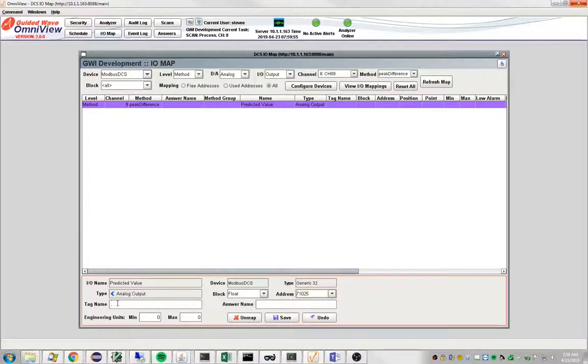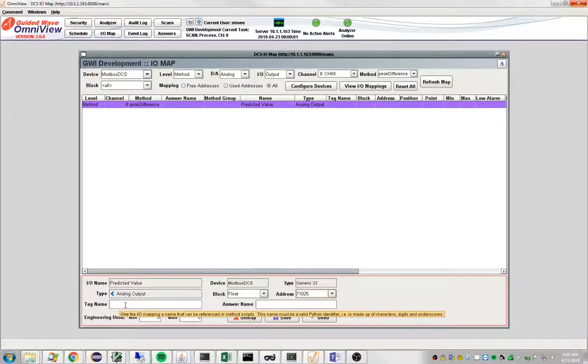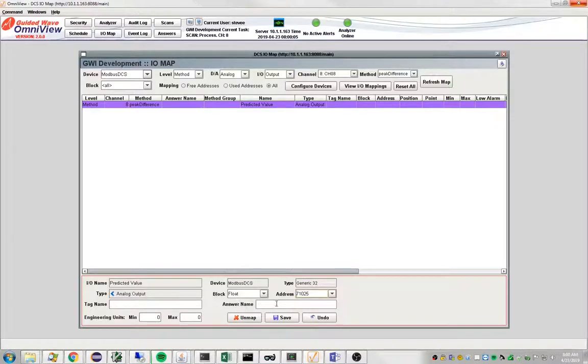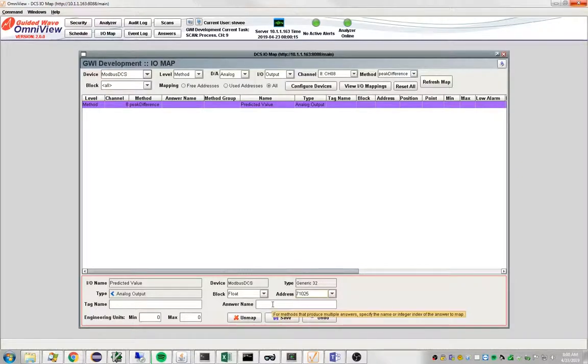Now, there's a couple other things here we don't need to provide. Tag names are used for inputs, so we're not going to assign a value there. This method is producing a single numeric result, so we do not need to specify an answer name.